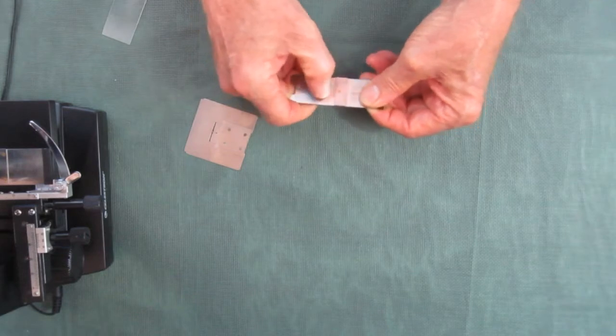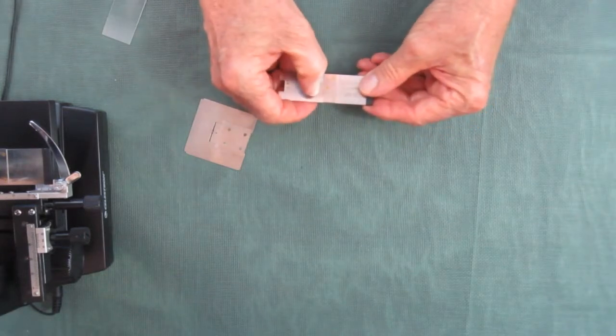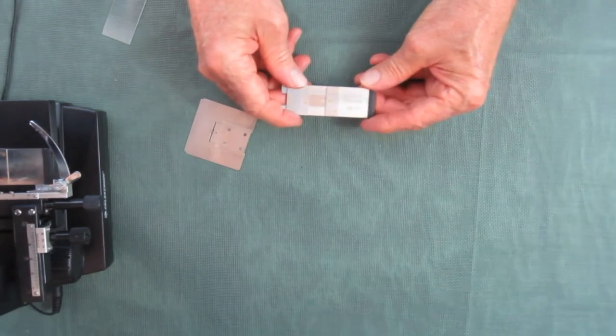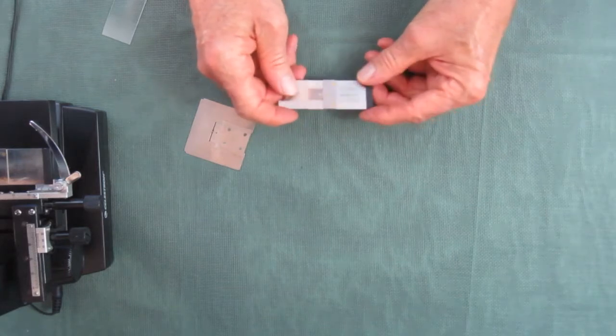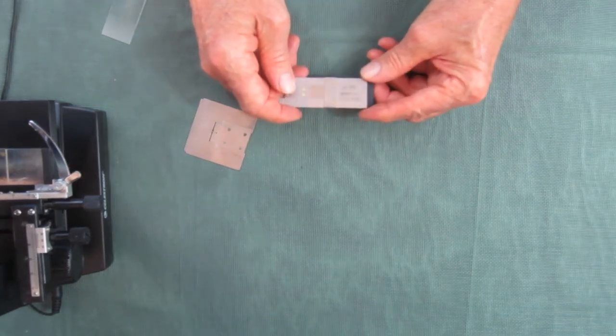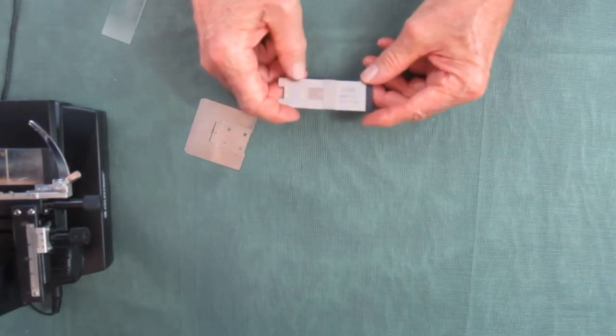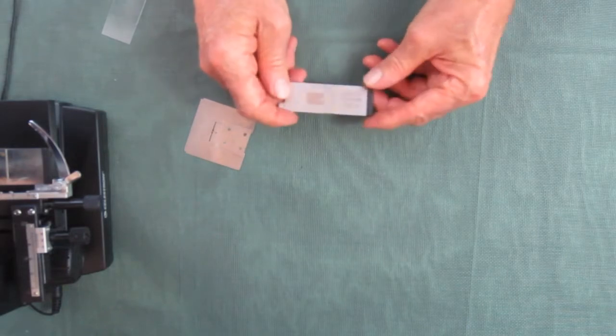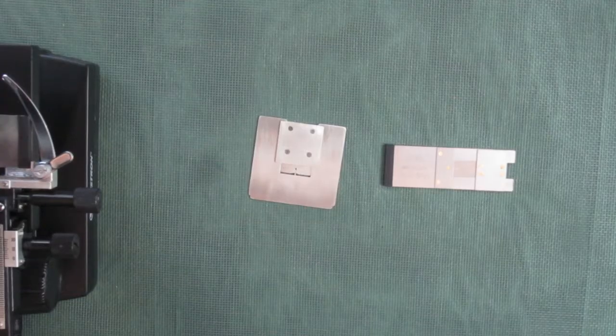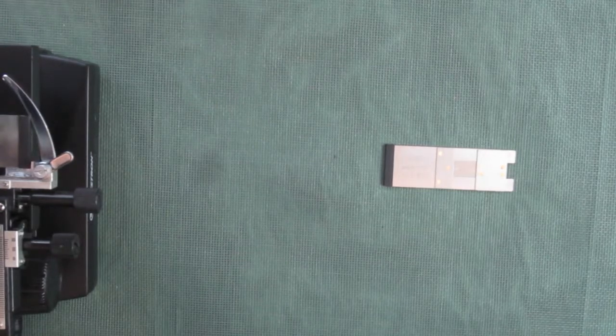So you get a very flush surface for your razor blade, and that's why the redesign.